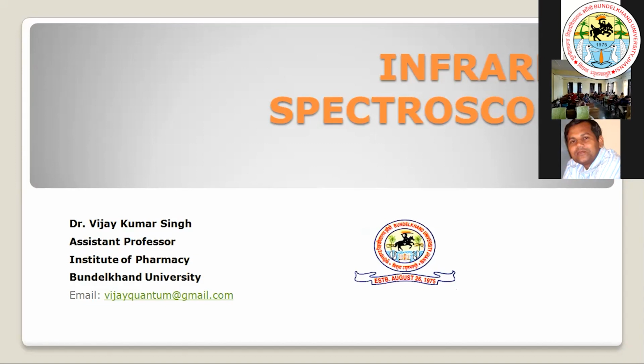Now I'm coming to infrared spectroscopy. As I told you, X-ray energy is of the highest energy level, a little bit lesser energy is UV, and again a little bit lesser energy compared to UV, the light that comes is infrared spectroscopy.